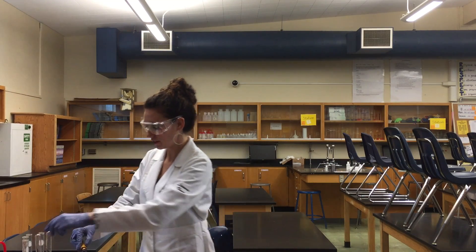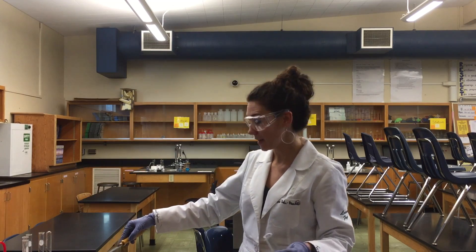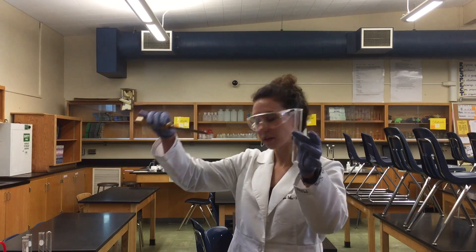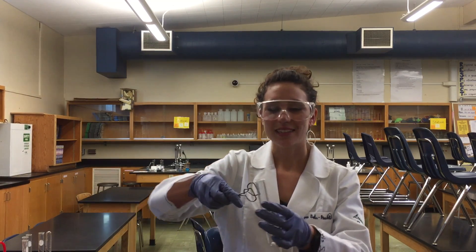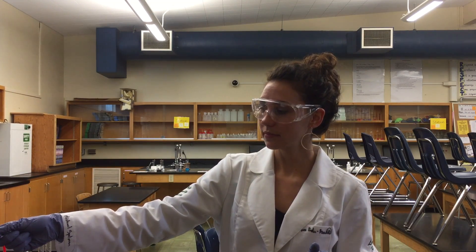Hello, at this station, you will be taking some ammonium carbonate, and I'm going to put some in our test tube here, and we're just going to encourage its decomposition by heating it up. So I'm going to place this over a flame, and in doing so, we should get three different products.